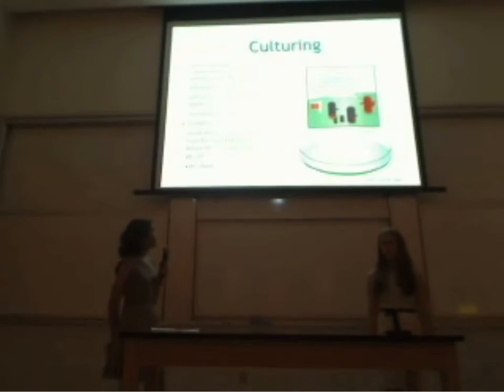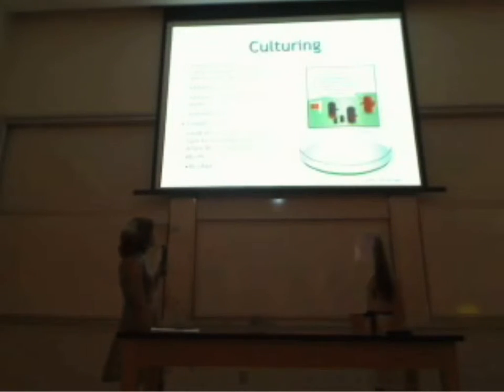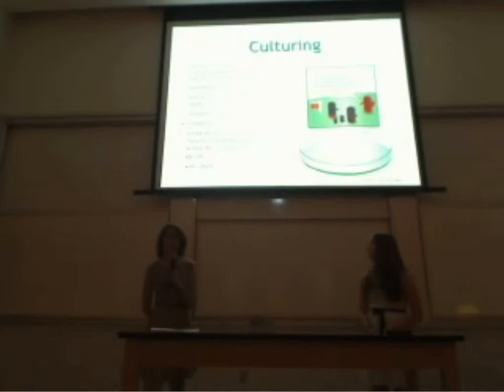We also made a liquid culture, and we did that by adding 40 microliters of E. coli of each type to 3 different containers, and each container had 50 milliliters of liquid LB, all at an ampicillin concentration of 50 micrograms per milliliter. Sorry. And we did twice as much just because it was twice as much of a volume of LB in there. We also incubated those. The reason we made a liquid culture was so that we could run what's called an optical density test.